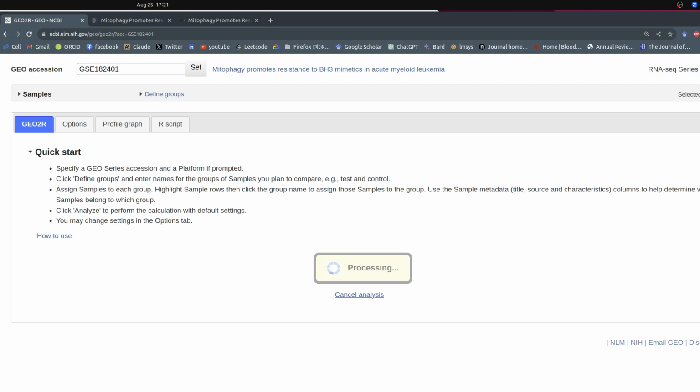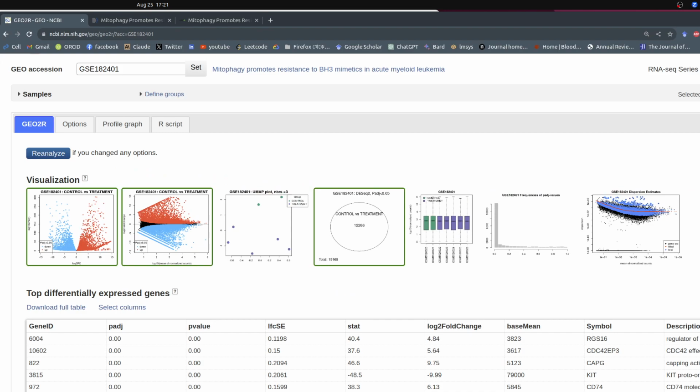The data is processing, and in the meantime they have this very beautiful visualization figure within 5 seconds, which used to take hours after hours for people to learn the basics of programming and do this analysis. So the first question that comes to our mind here is what algorithm and programming language was originally used to analyze this data set?